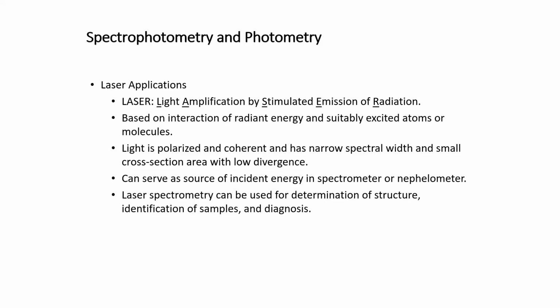Laser applications. Laser stands for light amplification by stimulated emission of radiation. It's based on the interaction of radiant energy and suitably excited atoms or molecules. Light is polarized and coherent and has a narrow spectral width and small cross-sectional area with low divergence. It can serve as a source of incident energy in spectrometer or nephelometer applications. Laser spectrometry can be used for the determination of structure, identification of samples, and diagnosis.